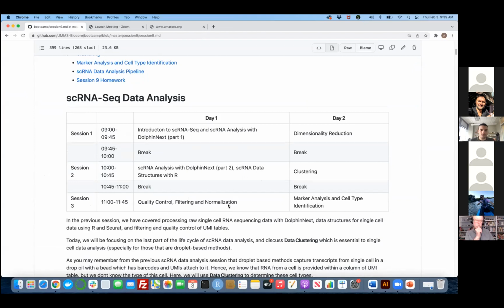We've seen how to normalize and filter, but now we are going to start with what I believe is the more mathematical part, and what I believe requires a lot of explanation before going forward, because we have to understand the essence of single cell analysis and why we are actually using clustering in the beginning. As a statistician and machine learning scientist who started doing biology a few years ago, I believe that single cell analysis is one of the most beautiful applications of clustering.